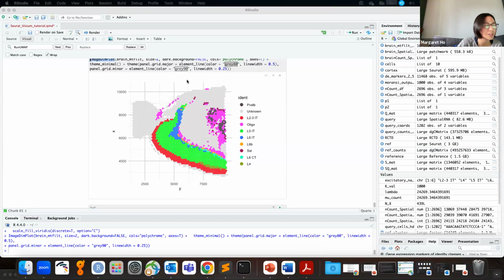You can think of these spots as almost being a mixture of cells, but when you're running these analyses, especially in the early pre-processing steps, it's treated as an individual cell so that it runs way faster. But Visium HD is much more customizable, and everything will take longer. The whole principles are all very similar in terms of the pre-processing steps and everything.